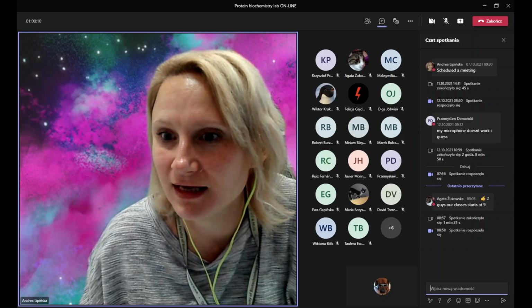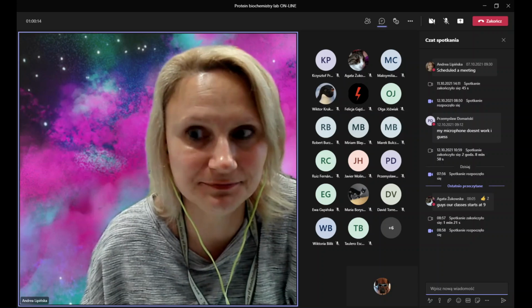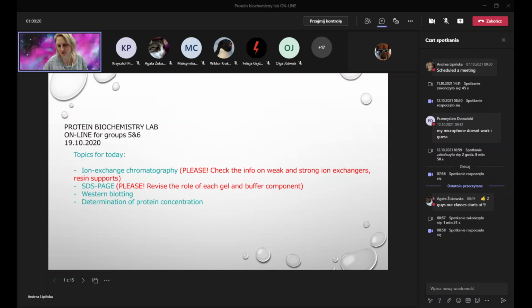Okay, and now again, I just want my presentation. Okay, two types of transfer of proteins to a membrane that we can use. This is wet transfer or semi-dry transfer. We don't have dry transfers, of course. And even the semi-dry transfers, they are not that dry. I mean, you cannot really let your sample dry.